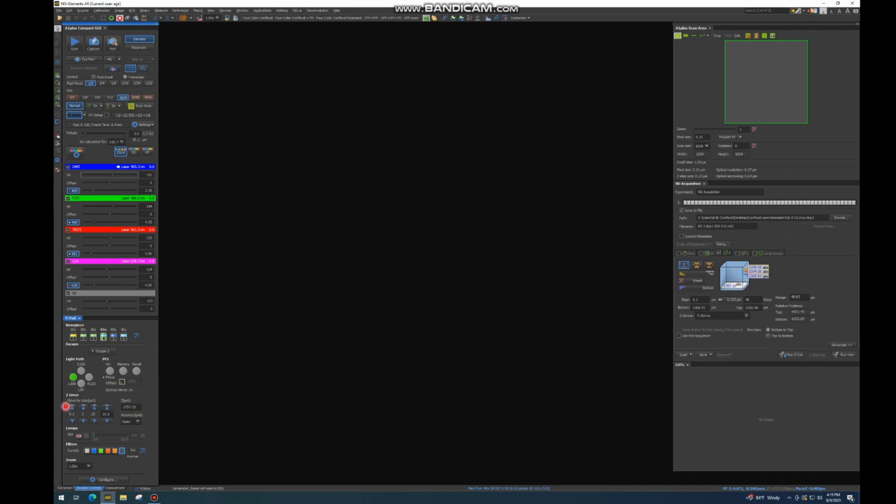Here we get into changing the Z position. This is one of the things that people actually find easier to do on the microscope with the Z position knob on the right-hand side of the joystick pad.